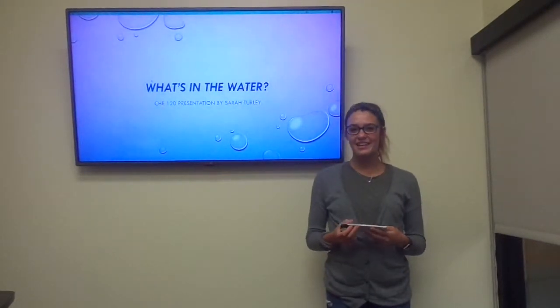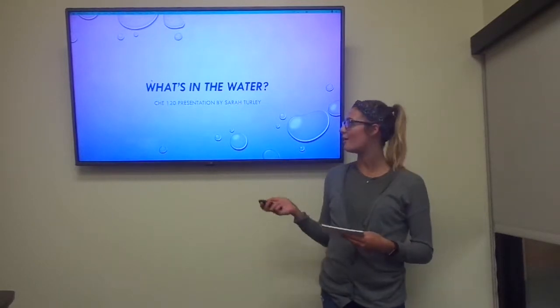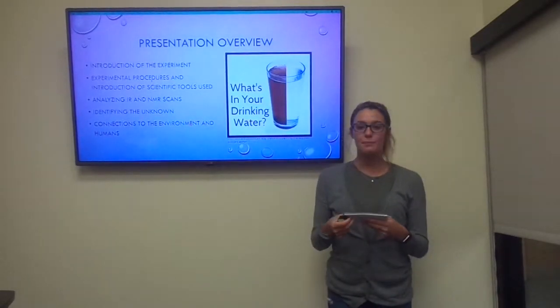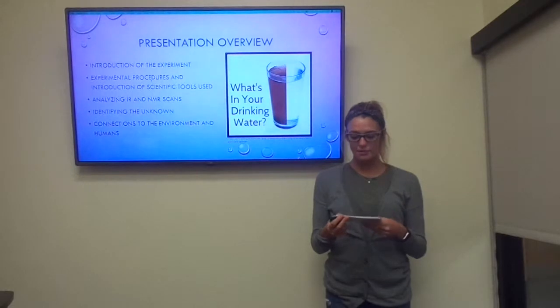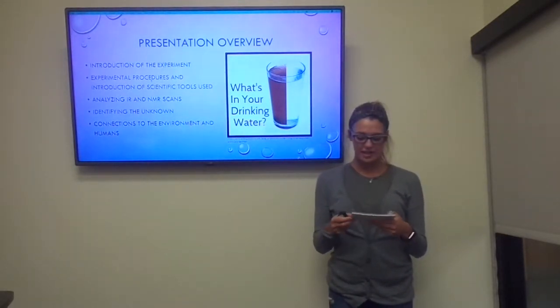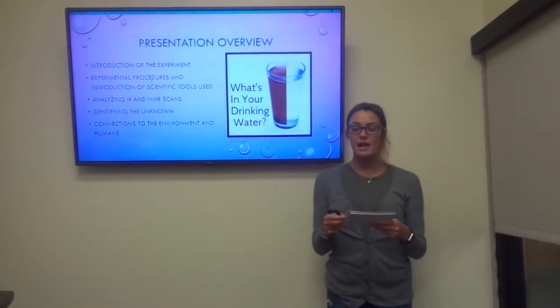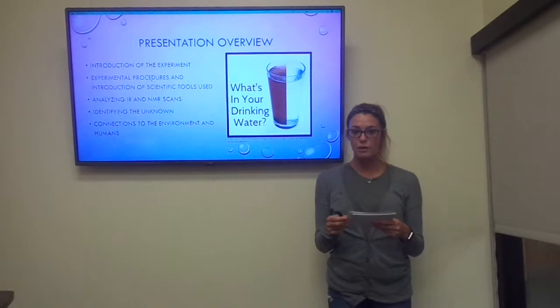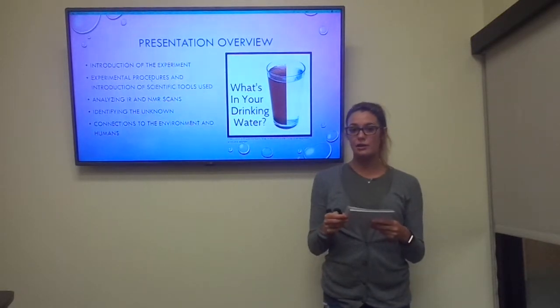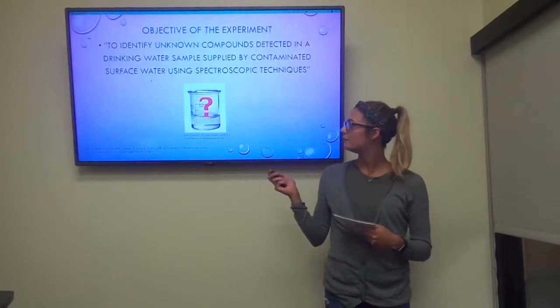My name is Sarah Turley, and today I'm going to be doing a presentation on the Chem 120 experiment, What's in the Water. So this is just a quick presentation overview. I'll be starting with an introduction of the experiment, followed by experimental procedures and an introduction of some of the scientific tools I used. And then I will analyze my IR and NMR graphs of my unknown, followed by identifying my unknown, and concluding with the unknown's effect on the environment and humans.